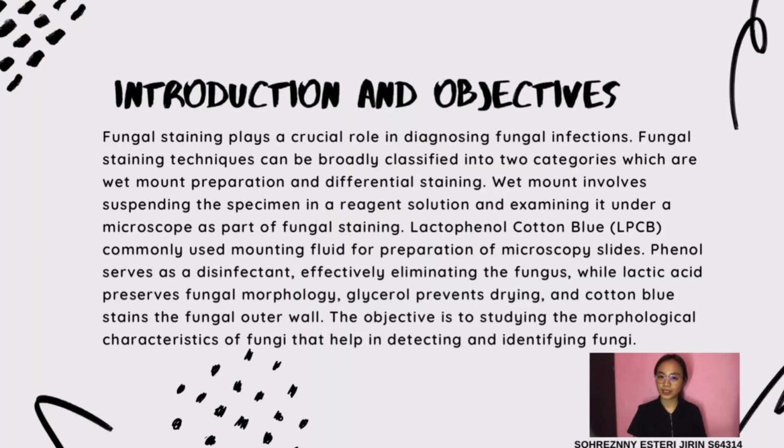Do you ever know about fungus staining techniques? Here I will talk about fungus staining techniques. They can be broadly categorized into two: first is wet mount preparation, and the second is differential staining.